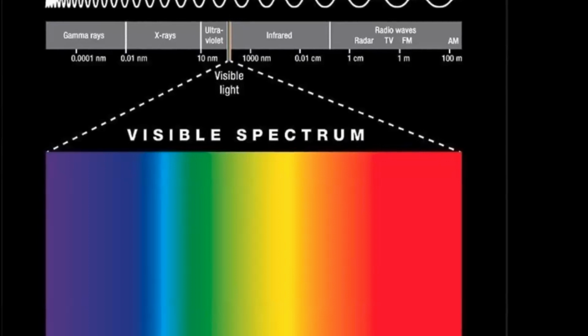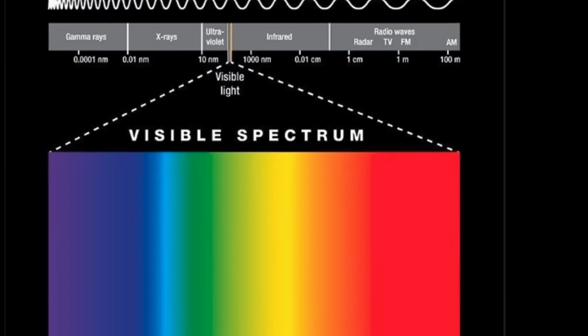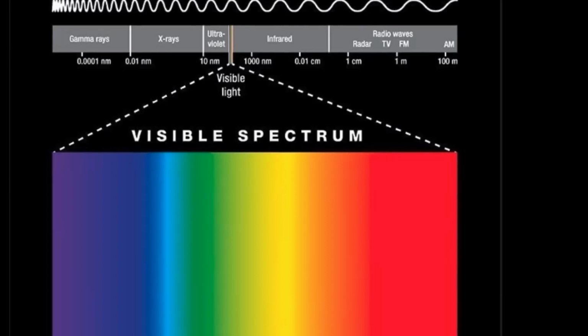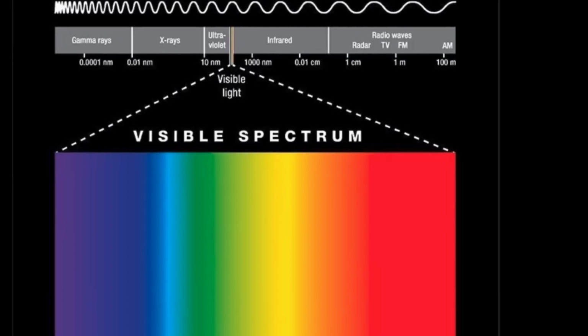There are people who are a little bit more sensitive to the UV or to the near-infrared light, but more or less it is this 400 to 700 nanometers, where 400 nanometers corresponds to the purple-blue color, and 700 nanometers to the orange, red, dark red colors. Okay, so this is a super tiny portion of the electromagnetic spectrum. It's so tiny that this proportion here is not correct, because the electromagnetic spectrum goes from gamma rays, whose wavelength is extremely small, in the order of picometers, to radio waves that can be in the order of meters or even kilometers. And we only see a super tiny portion, with less than 400 nanometers of difference between 400 and 700, maybe 750 if we're really good.